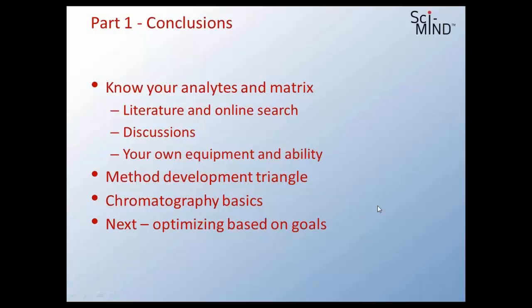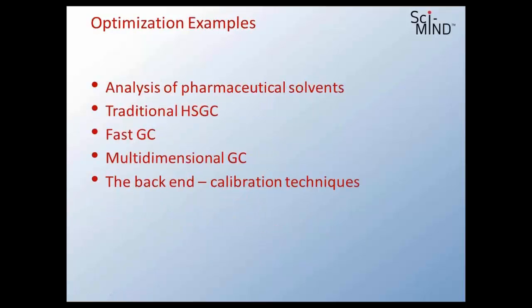I think probably in those types of extractions, the biggest technique these days in sample prep is still solid phase extraction. Nick, I'm going to cut in at the moment and ask that we probably have to move on. There are great questions that are coming on, okay? We have some great questions you can answer as you move through. Very good, thank you. I'll move ahead. You know what happens, you get a professor talking about things.